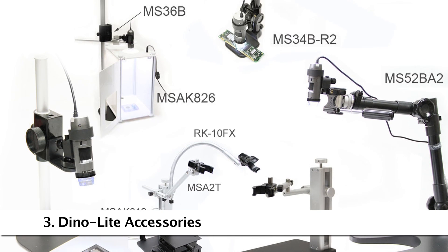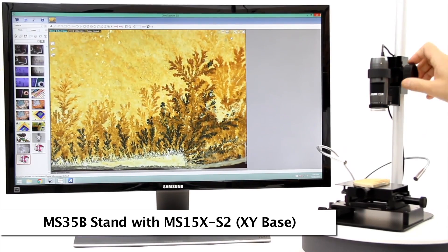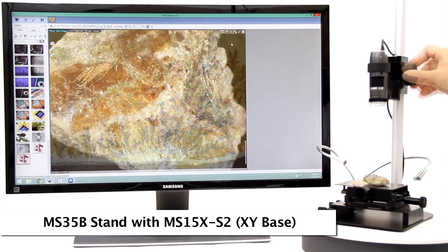Here are some compatible and recommended accessories. The MS35B is a reliable stand with simple height and fine adjustment that can be used with a precise movement XY base.